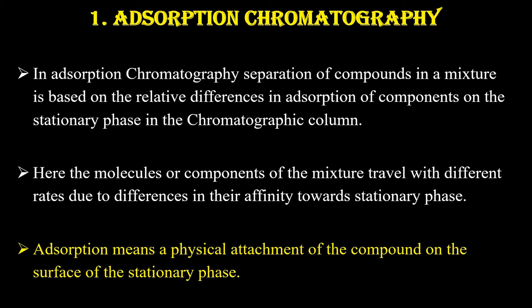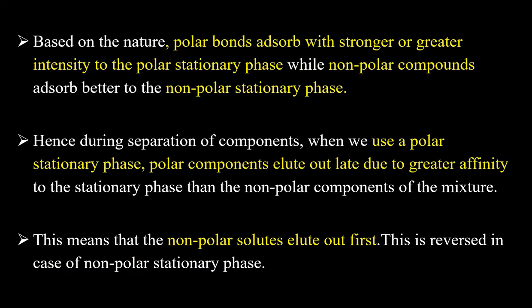Adsorption means a physical attachment of the compounds on the surface of the stationary phase. Here we will remember that adsorption is a physical phenomenon and the attachment is a physical attachment of the compounds on the surface of the stationary phase.